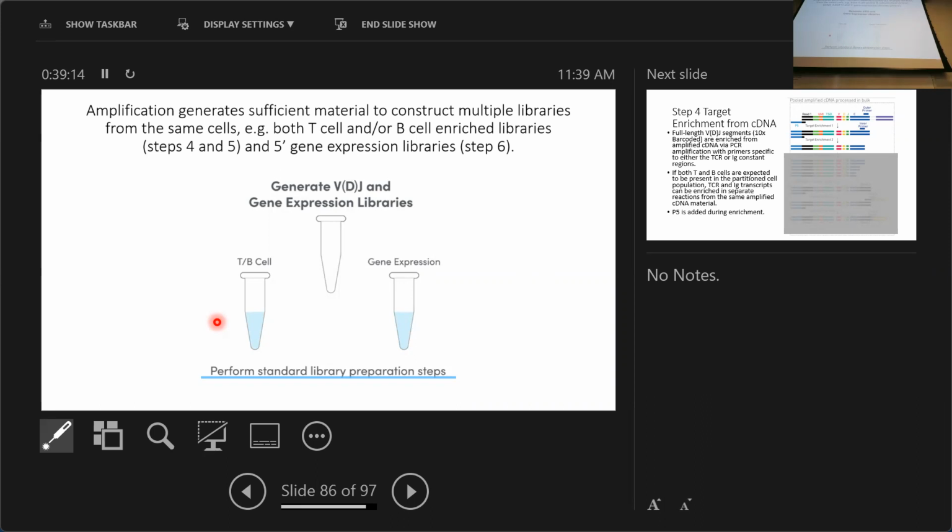So those are the cells, and then it's already lysed, open up. So you have all the mRNAs here. Those mRNAs were labeled, for example, this is green, this is red. This is from a 10x Genomics barcode.